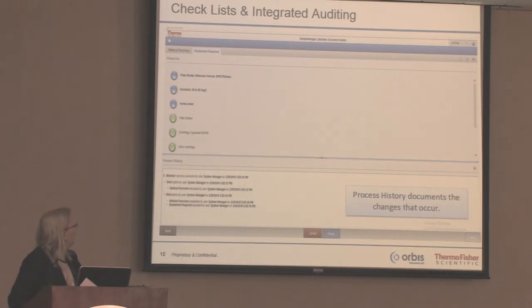So you can have a list of instruments and a list of reagents. You might have preparation steps, so they can prepare them. And again, the way it's displayed, you can have buttons, you can have checkboxes. You can actually prompt them to enter the data.